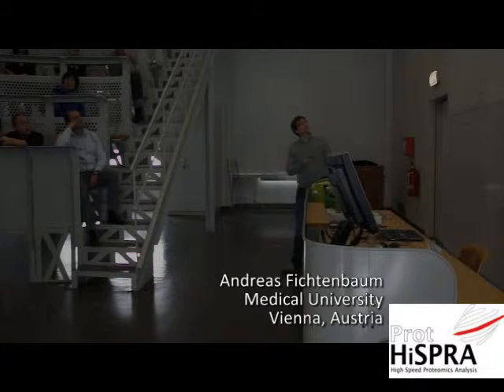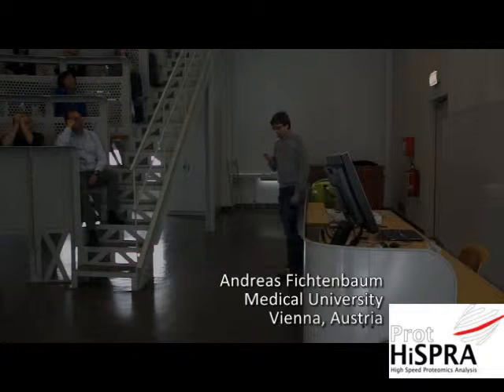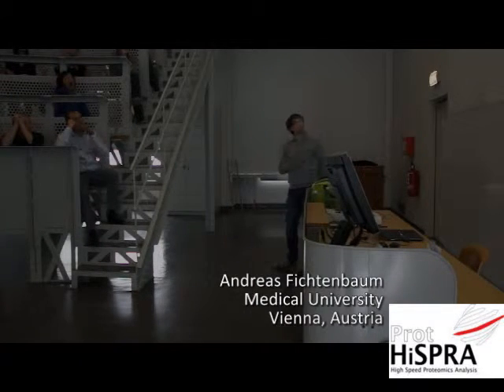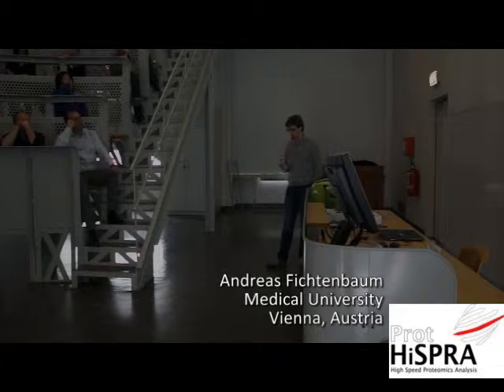So this is the column as it looks. It's a 100 microliter column, and I will jump to the next. So this was simple testing for the column. The titanium dioxide column using this phosphorylated peptide, and also non-phosphorylated. It showed in the loading phase that without phosphorylation it goes through the column, it does not bind, and here it shows that the binding was okay.